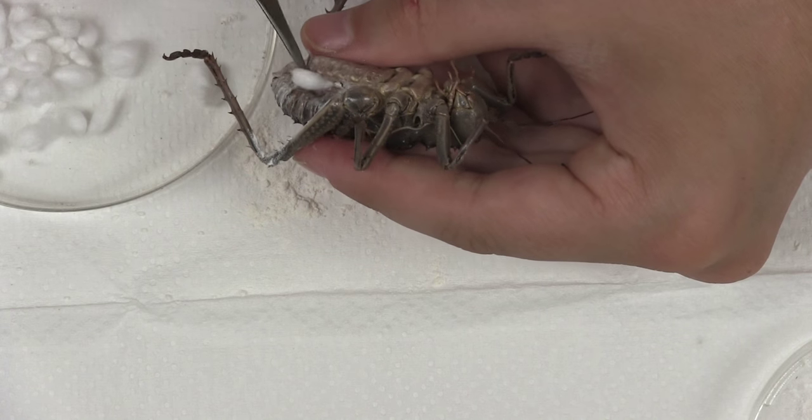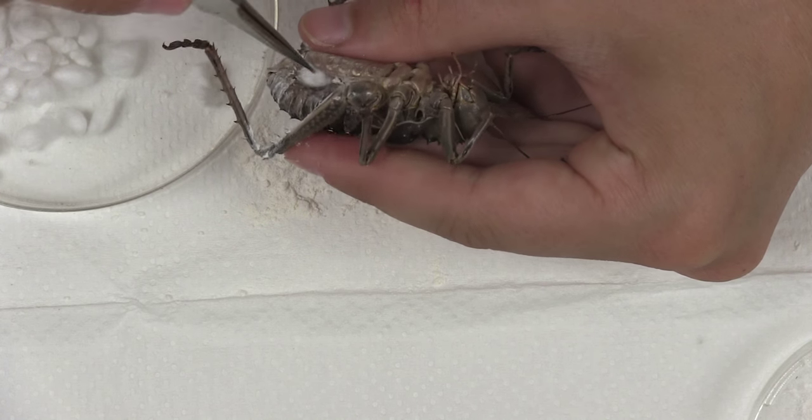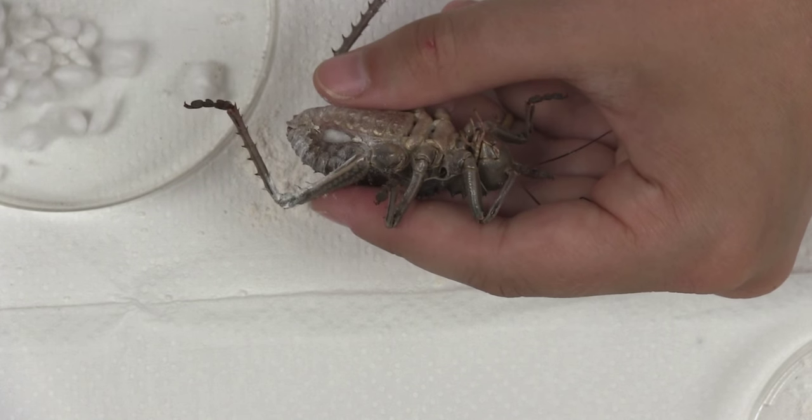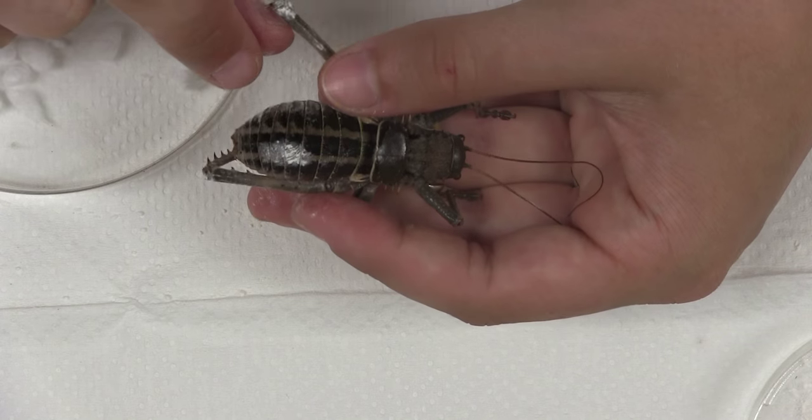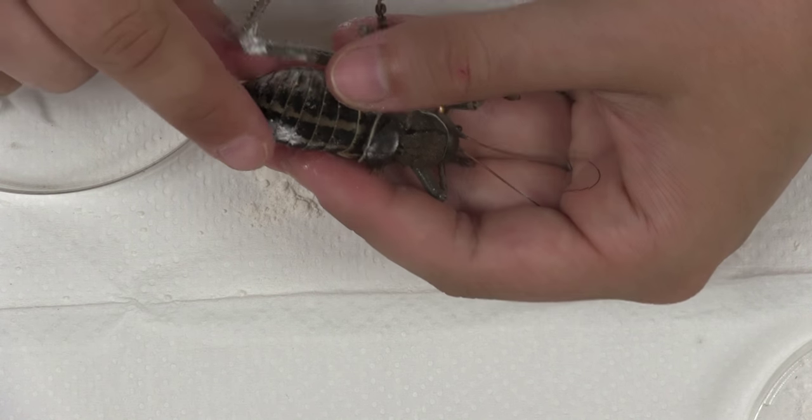Next, stuff the insect with cotton balls you prepared. Be careful to keep the incision as small as possible and stuff the insect until the entire cavity of the abdomen is full. Be careful not to overstuff the insect — it should feel and look natural.